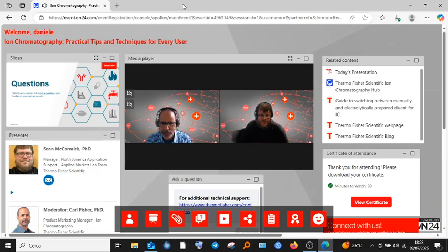Okay, so 2 minutes. Maybe we'll tackle one more. How can IC be integrated with other analytical techniques for comprehensive analysis?